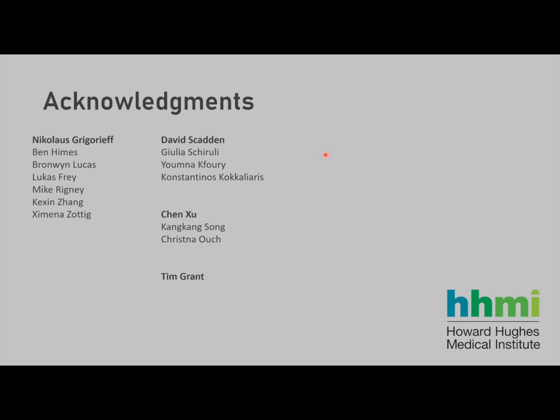Thanks. My final question is that in the last paper, it was really nicely shown that you can locate ribosomes and get the poses, but there was no successive alignment. If you do subtomogram averaging, how far can you go in terms of resolution? That is a good question. The reason we don't do any refinement is because we already have that refinement, right? In a refinement, you would very finely change the orientation of your reference and compare that with your image, which is precisely what we're doing in the first place. So your data is already post-refinement.